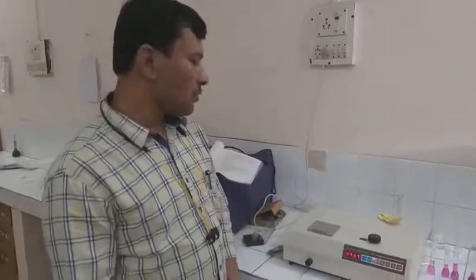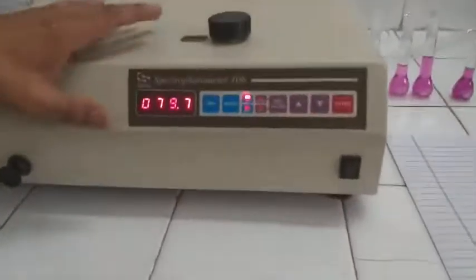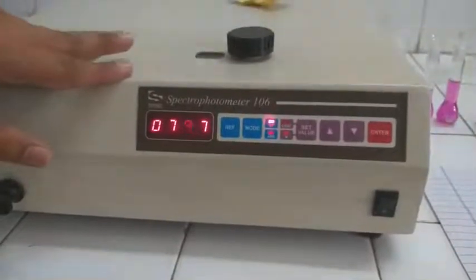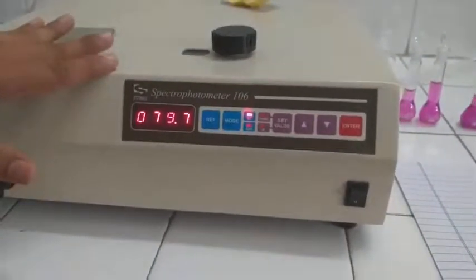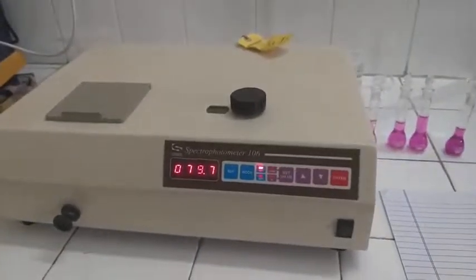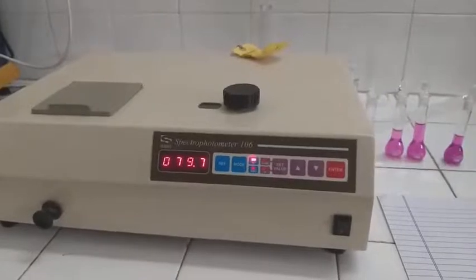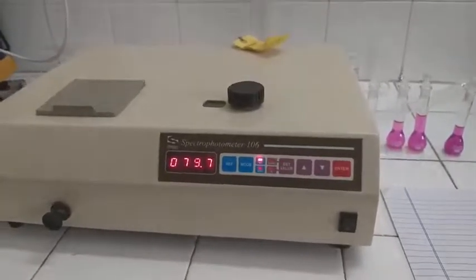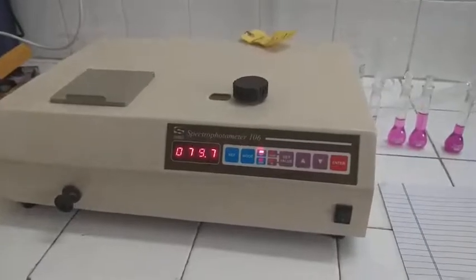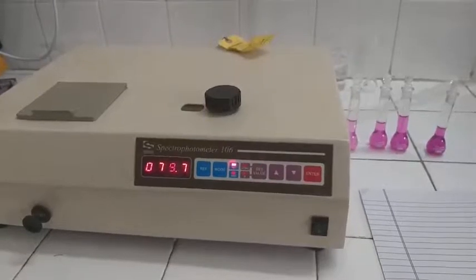Now we are going to demonstrate the single beam UV-Visible spectrophotometer. This is a digital UV-Visible single beam spectrophotometer. Before any chemical analysis, switch on the instrument and warm up for about half an hour, then start the chemical analysis. This spectrophotometer measures the transmitted monochromatic radiation from the colored sample.